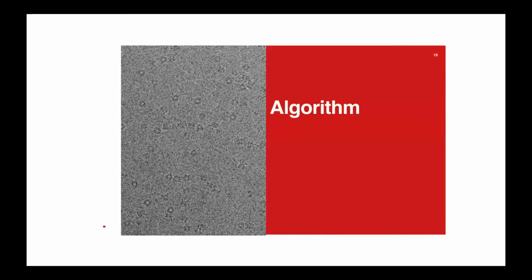So now I'll focus on the algorithm. In the bottom-up view, we saw that distribution matching is a nice thing, and we can actually recover the ground truth using it mathematically. And now we are wondering what kind of distances we can use.